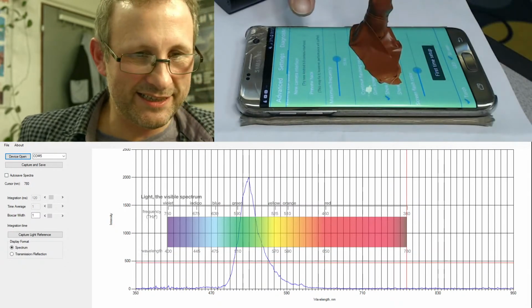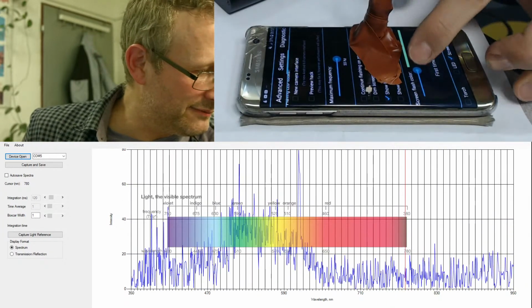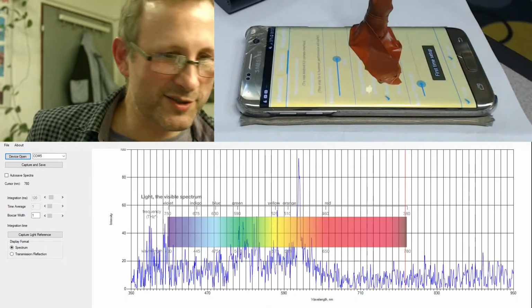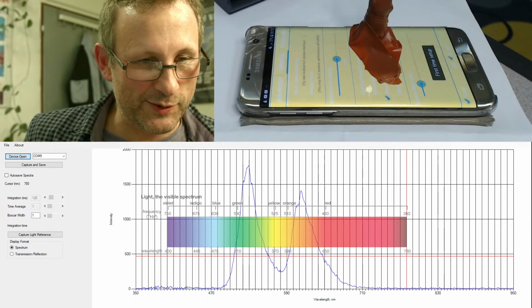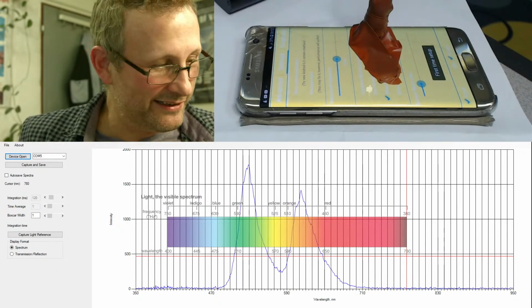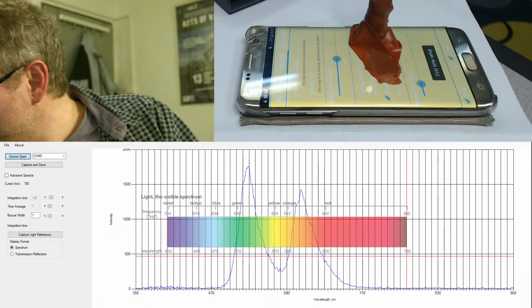I can tell you with my eyes that what's on the screen is green, and in fact it's better when you see it there. Now if I go down here, let's try a sort of yellowy color, okay, and turn on the torch. Now you see how it's making the yellow there? It's mixing the green with the reddy orangey color, okay? So it's actually using color theory there to create our yellow. And when I'm looking at this screen, it really is very yellow to my eye. Okay, so it's achieving the goal there.